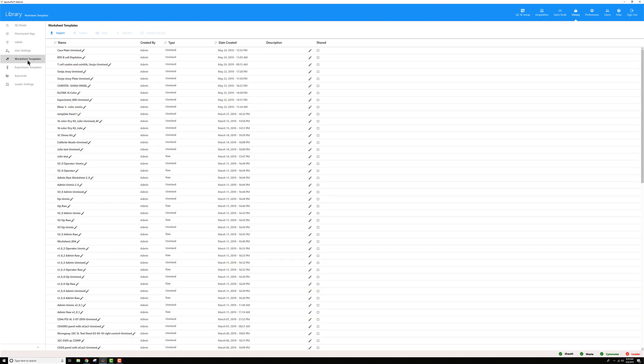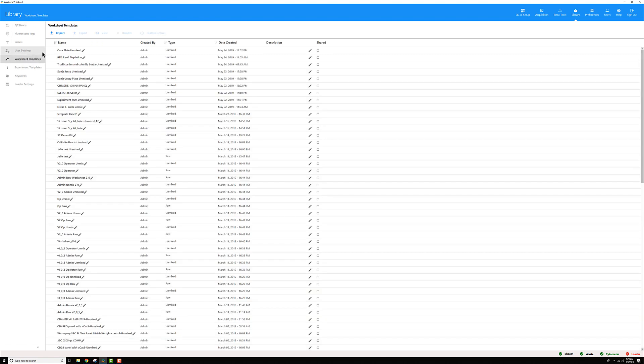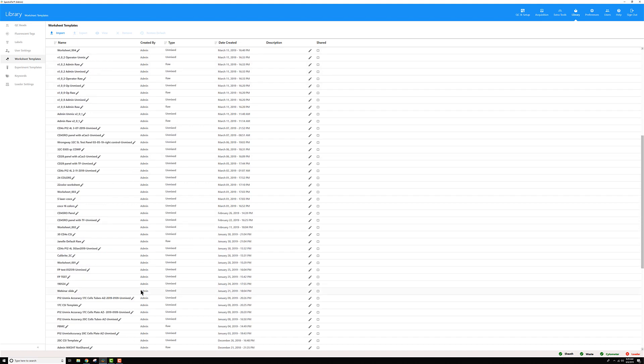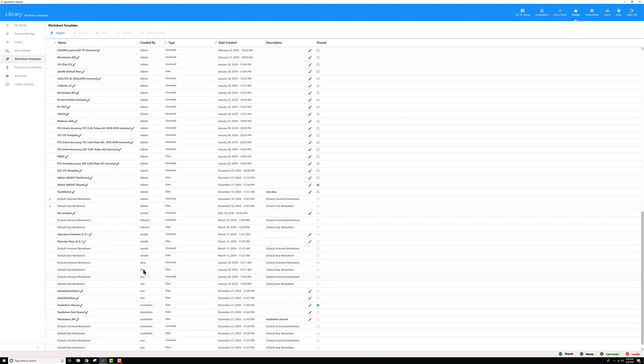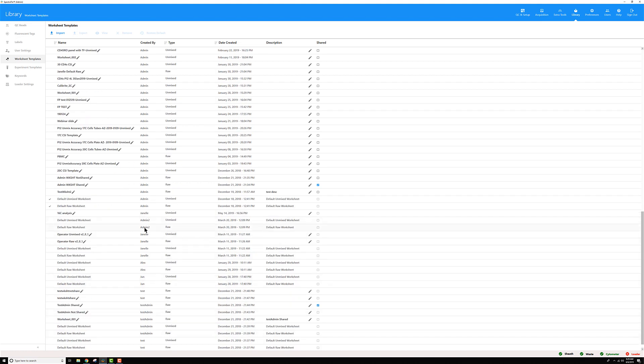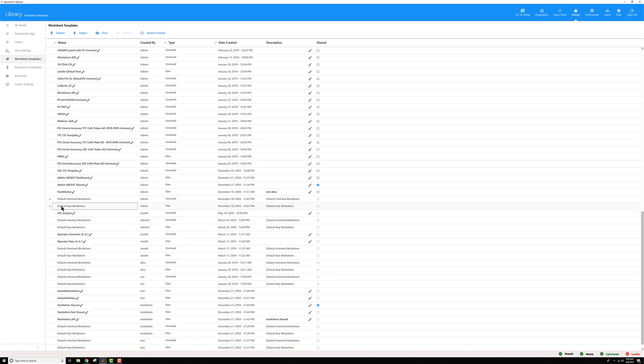Then for the user account you're in, so for me I am in admin and I want to reset my default raw worksheet. I need to find that worksheet in my list. There's quite a bit of worksheets in this software version so I need to scroll down a little bit. Default raw worksheet admin, there it is. I can select that worksheet, then up here click the restore default button.